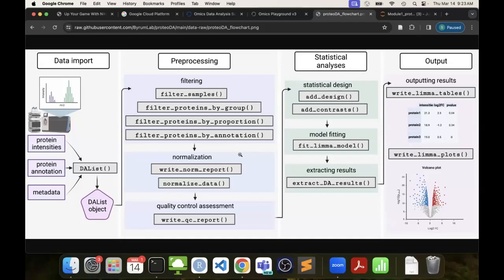So there are options there. We tried to design this so that you really have a lot more power to do what you want to do with your data, and not us just saying you have to do it this way. I don't want to make it so strict.